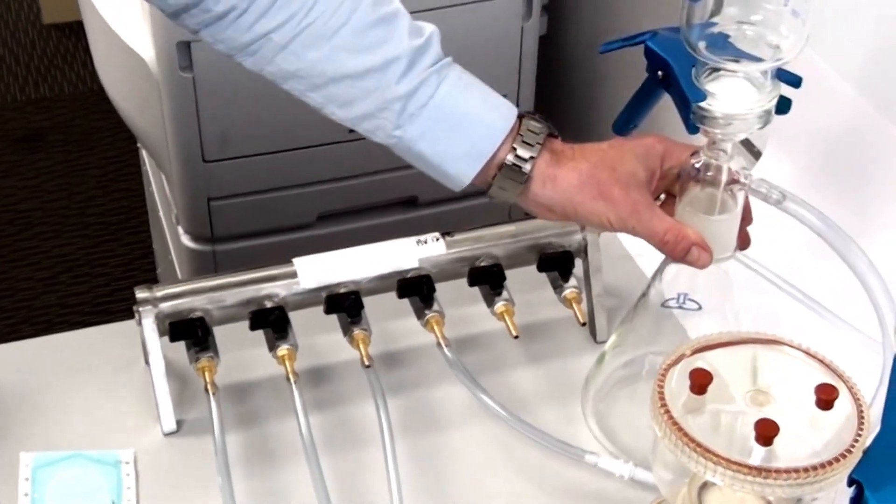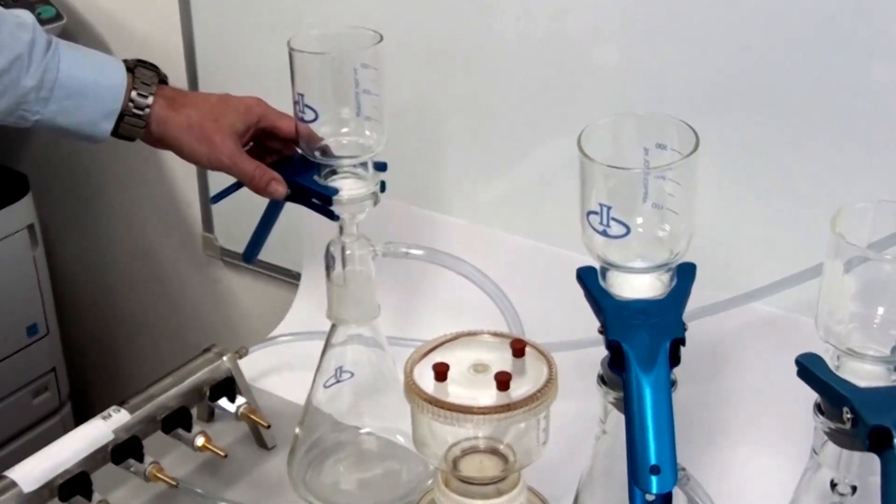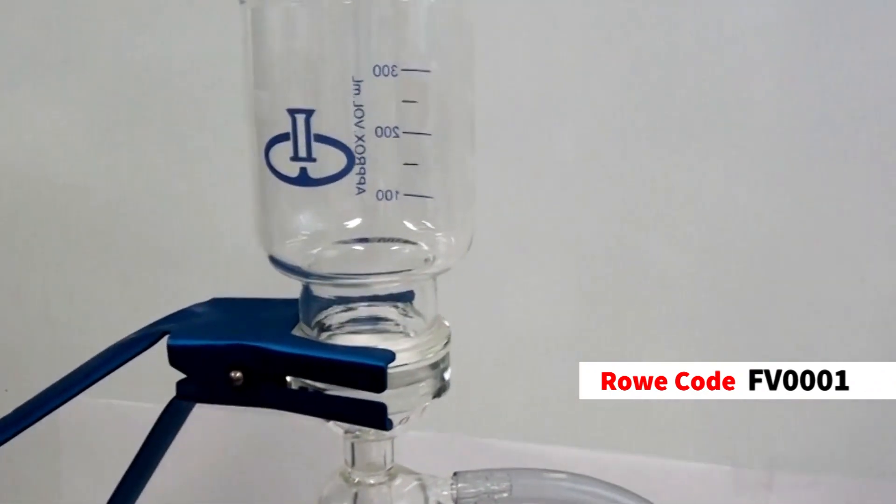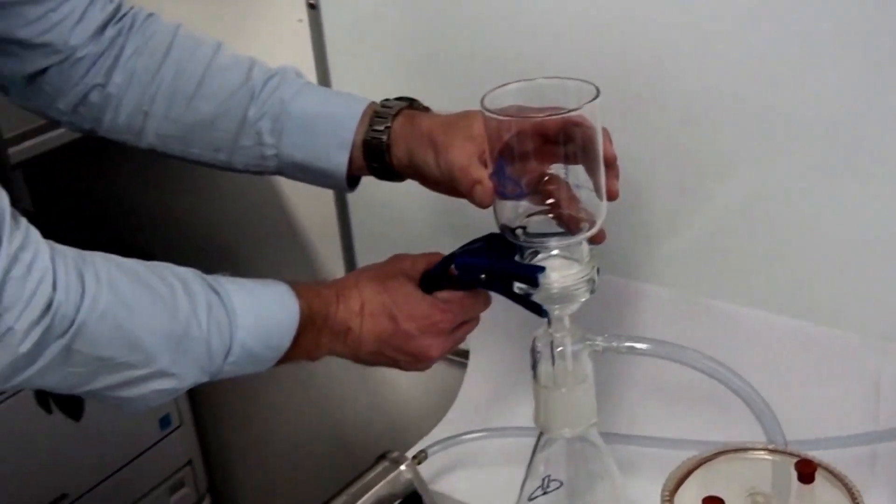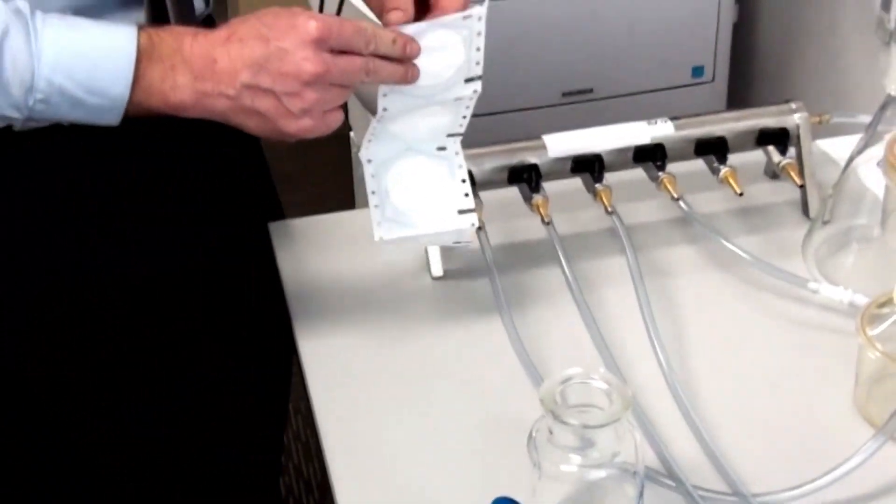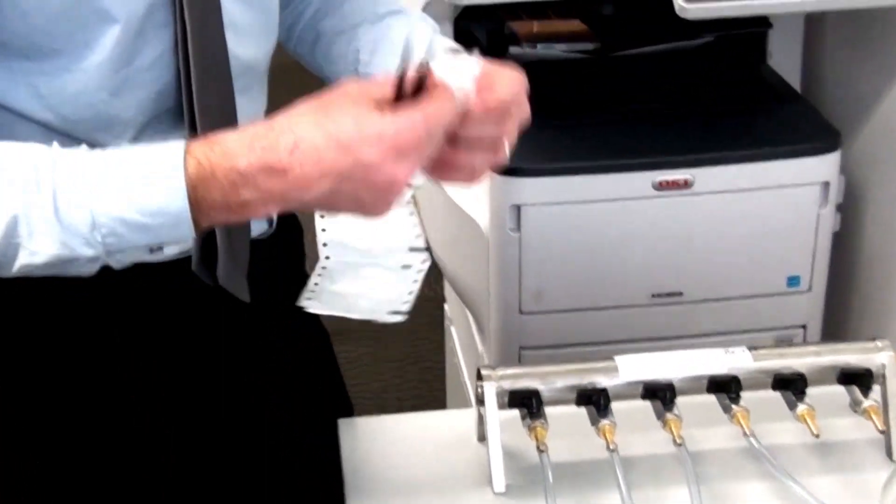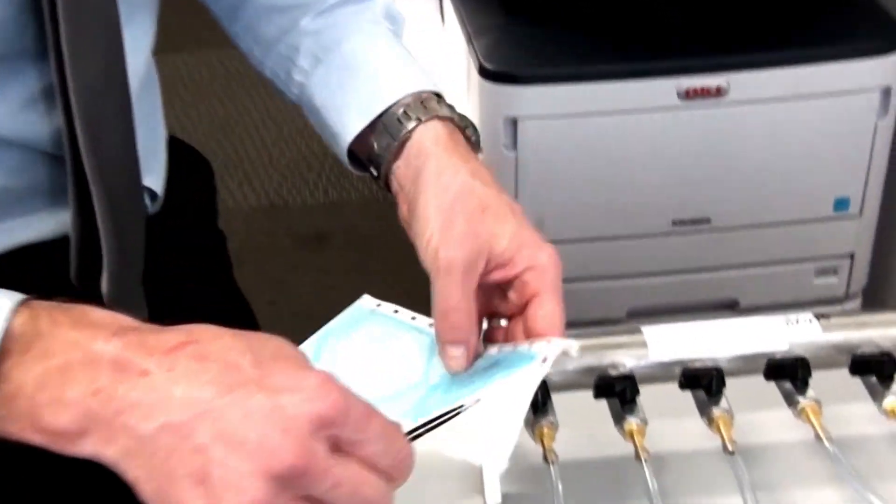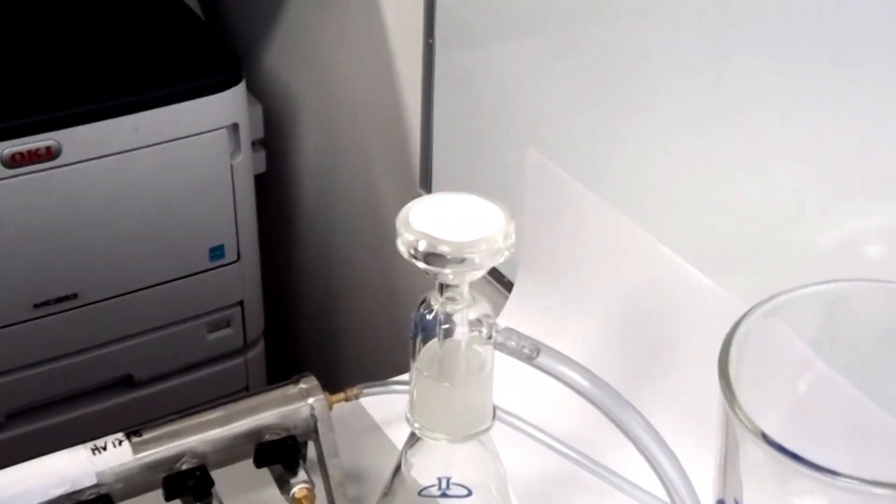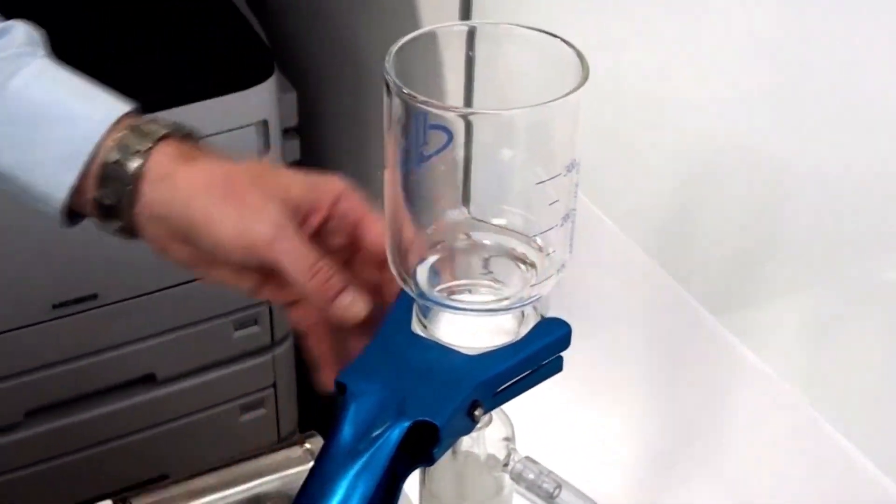Okay, so the first filtration setup we've got here is the Filter Bioscience part number FV0001. And I've got membranes here. This just comes off like so. I'll pop a membrane on here. This is a 47mm membrane. Pop that on there with the forceps. Okay, so that's good to go.